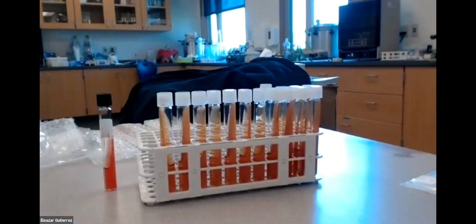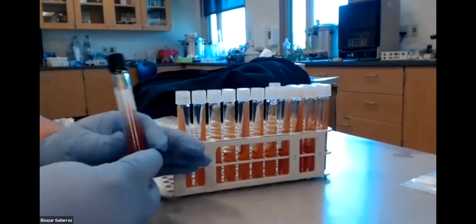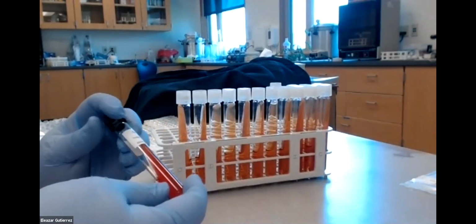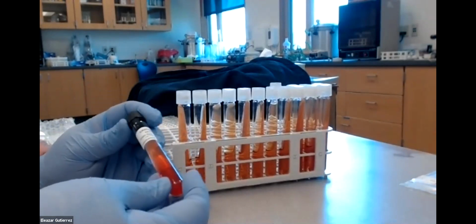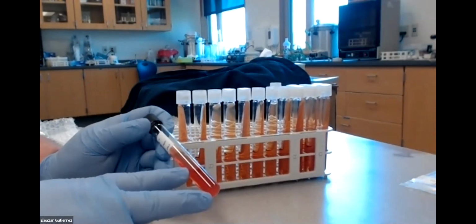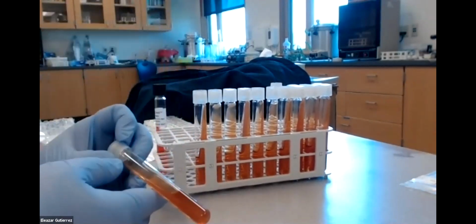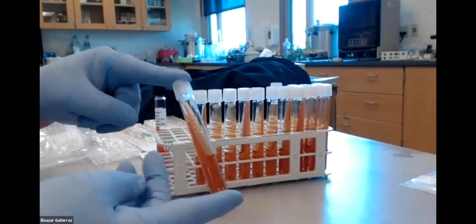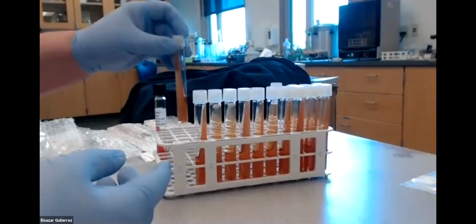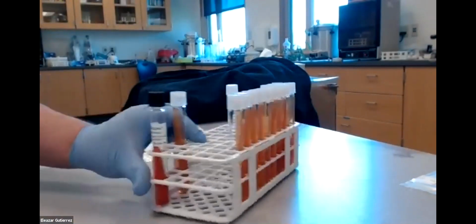Okay. So this is what the TSI slant looks like. The one that Carolina Biological looks like this. Okay. Triple sugar iron agar has a deep butt. I had Chris make extra because I was expecting you guys to have problems with it. So those are the ones that we made here for the lab, same color. Okay. And what do we need? Well, we need the TSI.